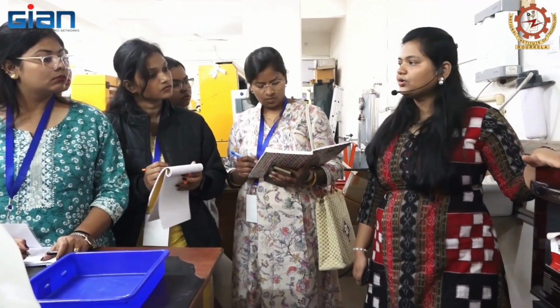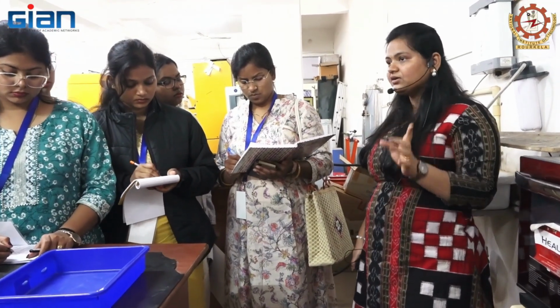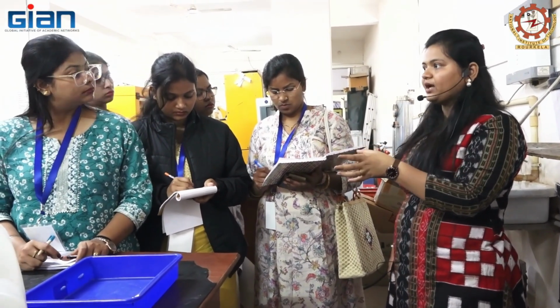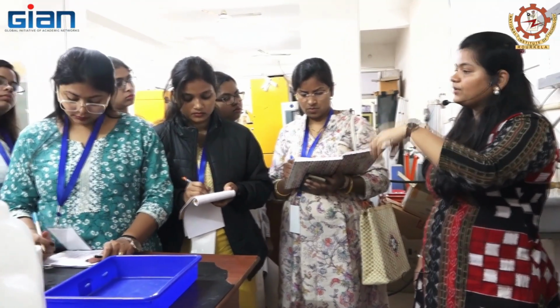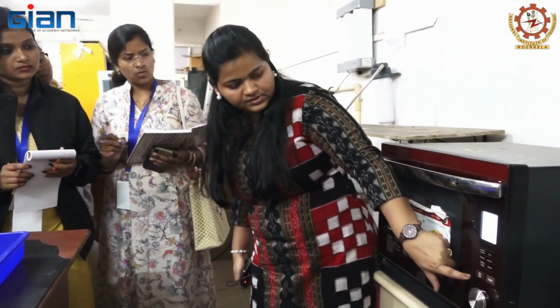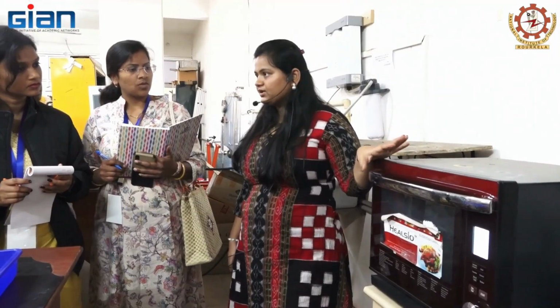But in the microwave the process goes from inside to outside, because it acts at the cellular level. As I have told you in the mechanism, due to dipole and ionic conduction, the heat is generated from inside the cells. So it's already done. Stop. Then it will cool the machine, and then it will be automatically over.